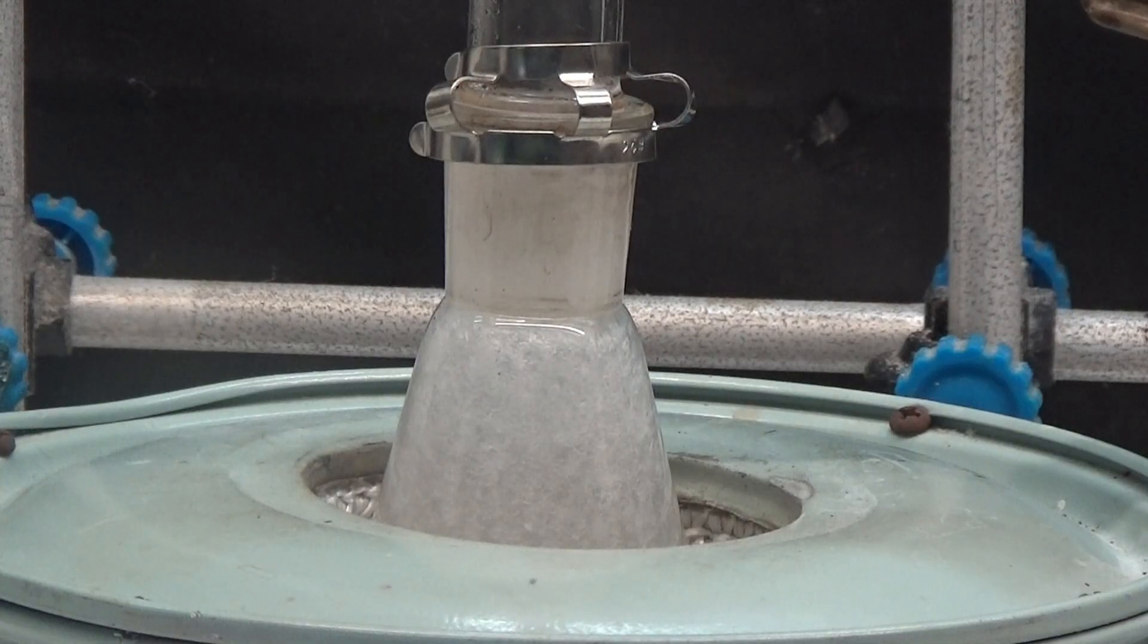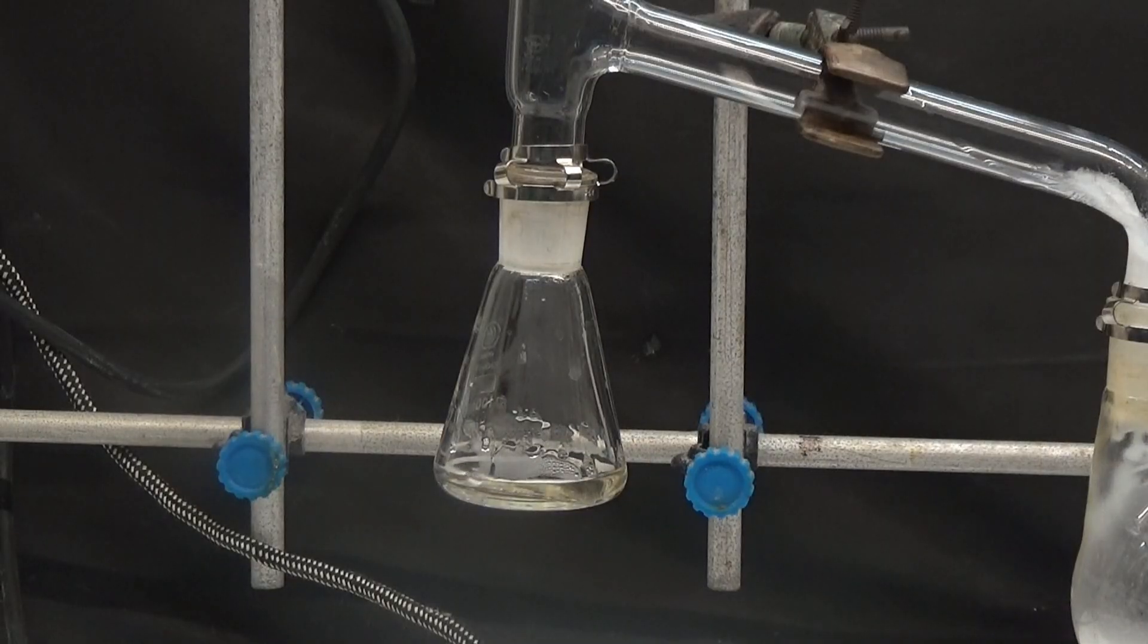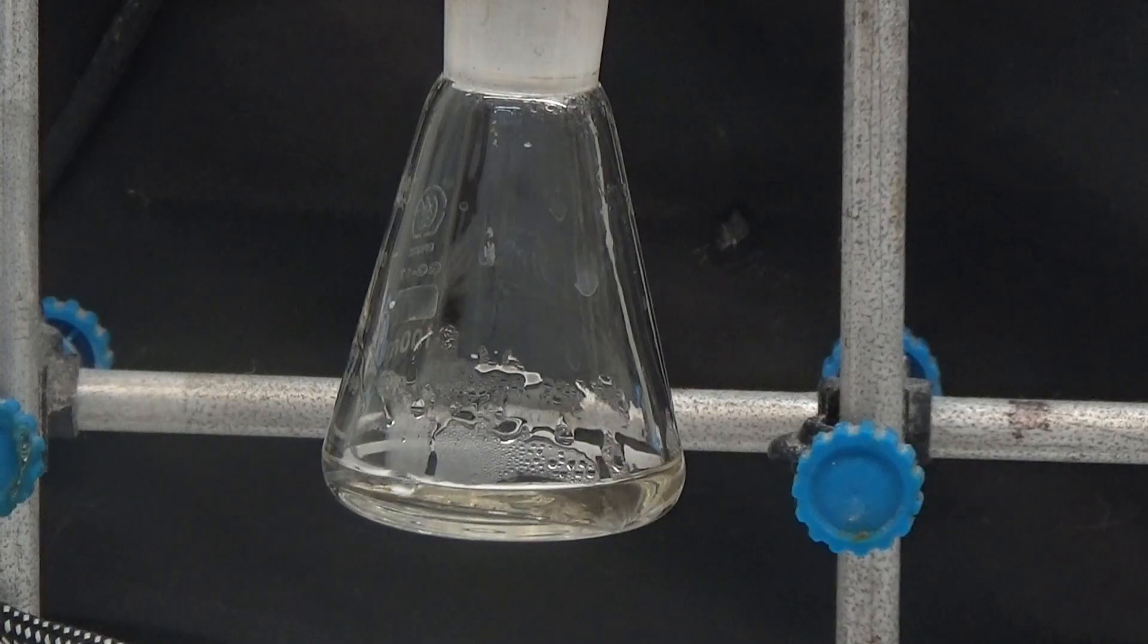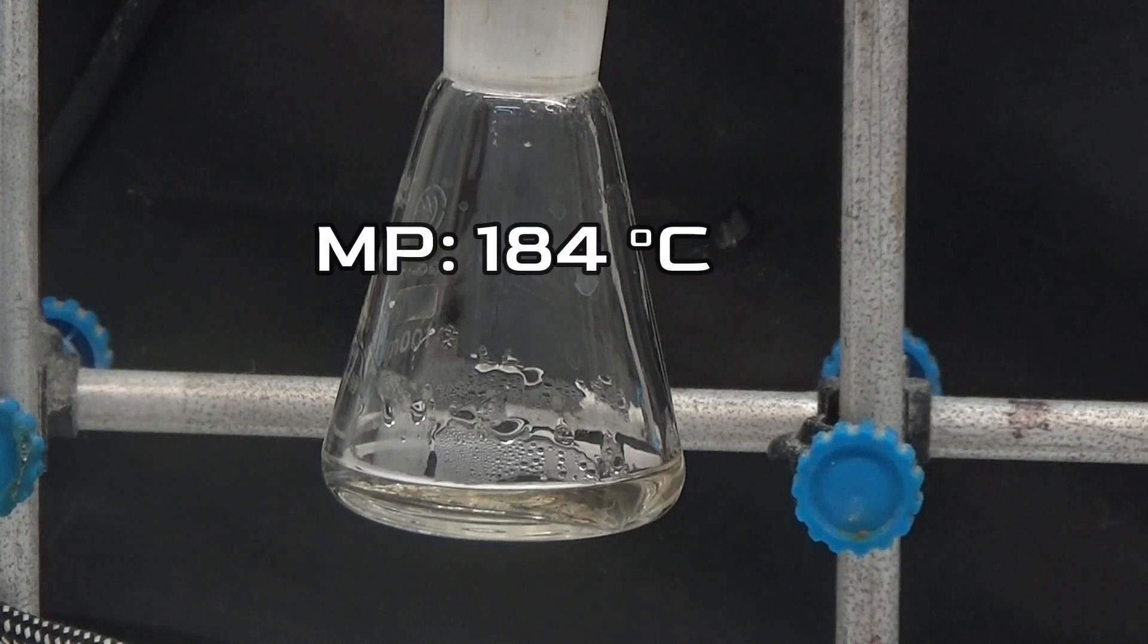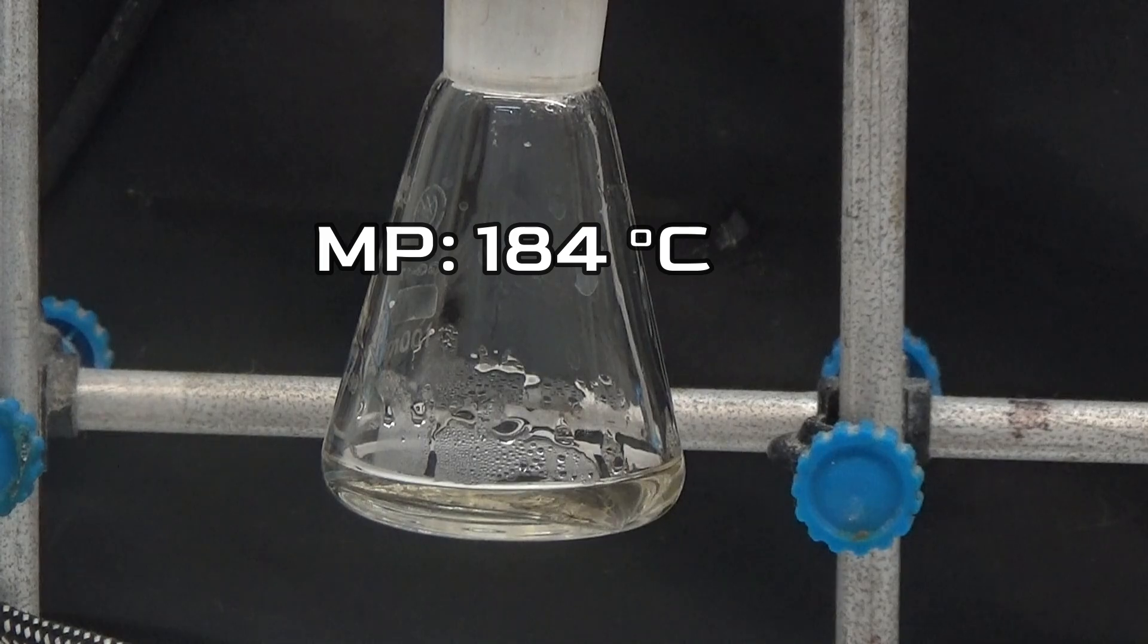We heat the flask with a heat source capable of producing more than 250 degrees. At a temperature between 180 and 200 degrees, the acid has completely melted. Succinic acid has a melting point of 184 degrees.